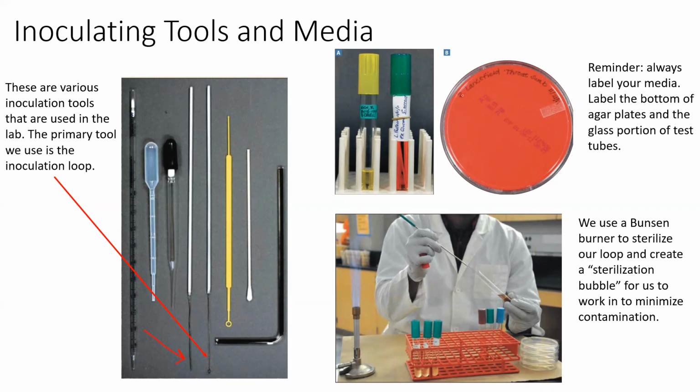And notice here that you write your information along the edge of the agar plate, because the agar plate shown here is a blood agar plate. It actually contains normally sheep blood. But a lot of times the agar plates are that more beigeish, clearish kind of color, like you see in this bottom picture. And so you don't want to write real big in the middle of your plate, because it's going to skew your results when you're looking at it. You're going to get distracted by your Sharpie writing on the bottom of the plate, and it might make viewing those colonies a bit more difficult.